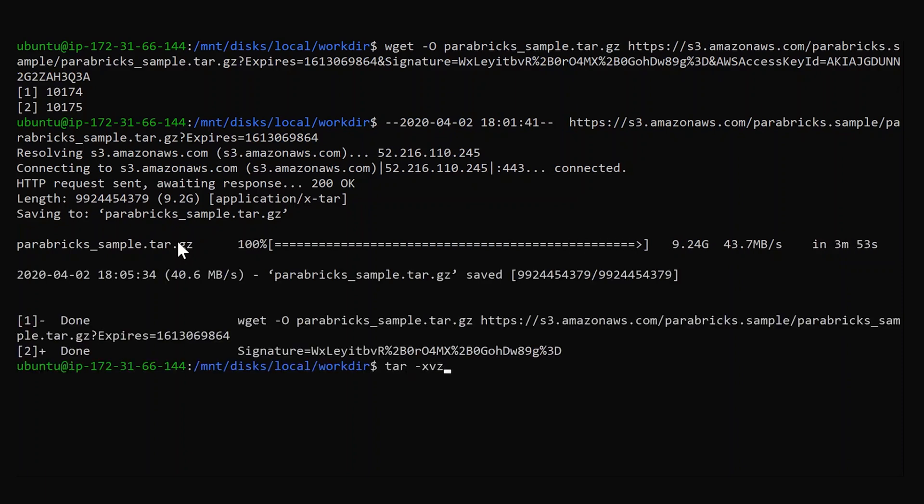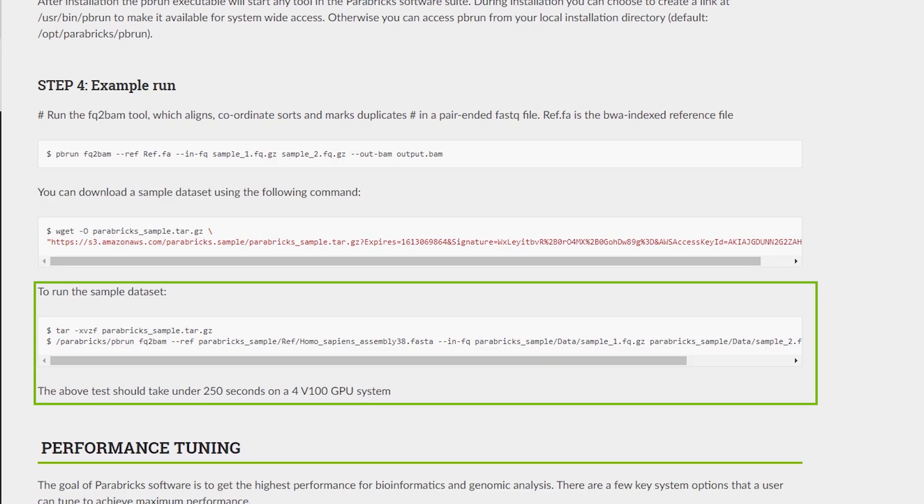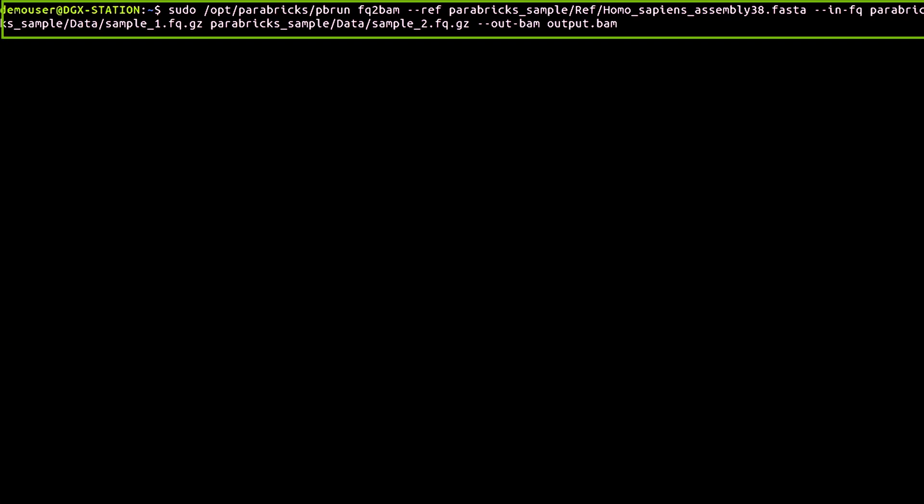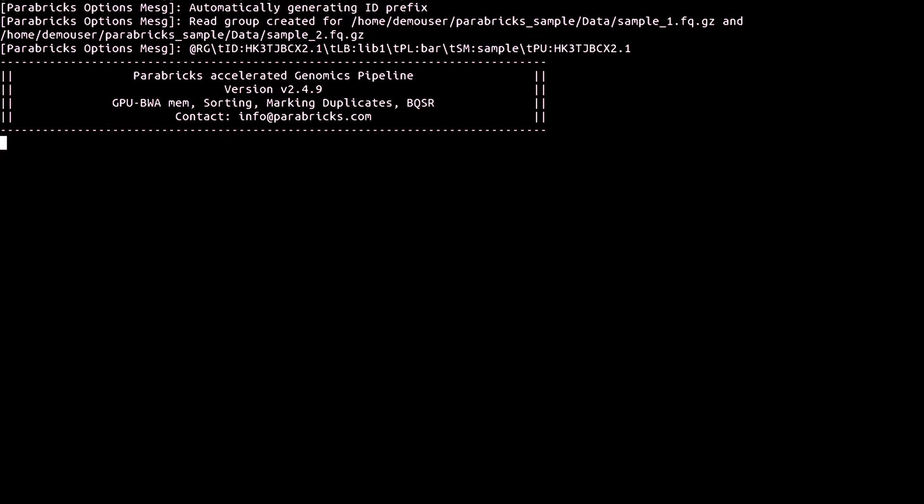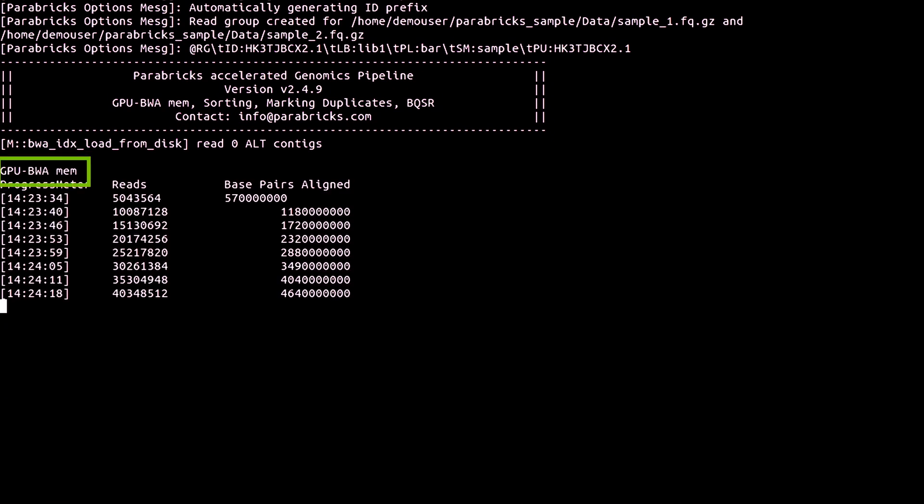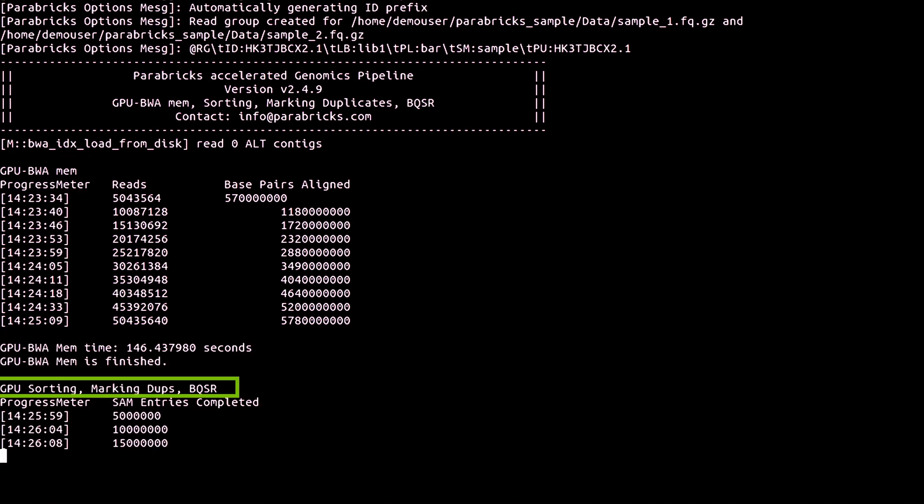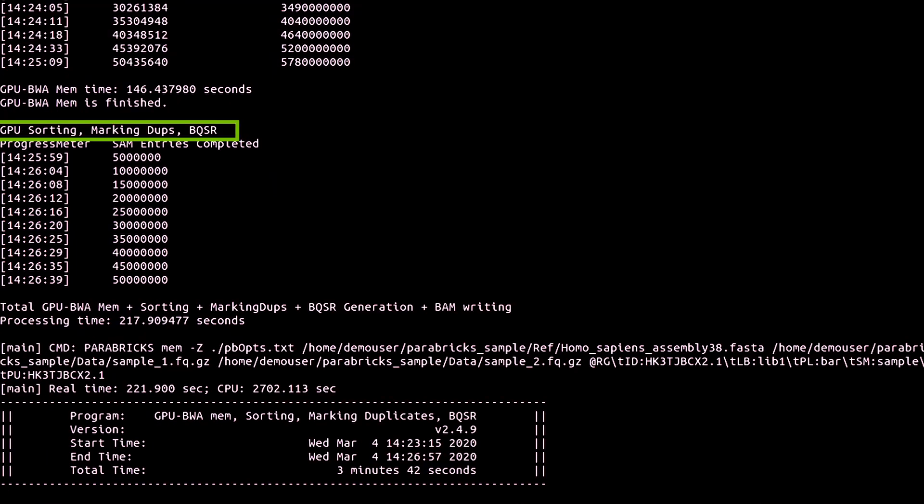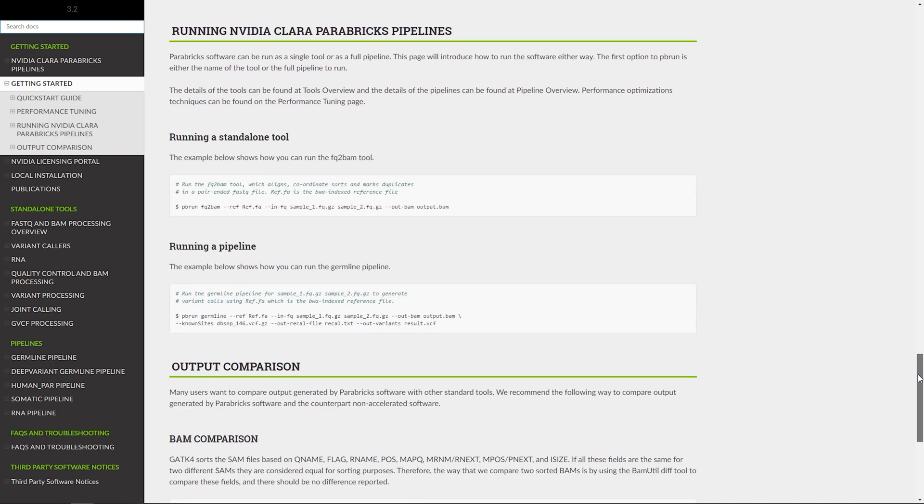This command will initiate the download. Uncompress the file. Now, we'll analyze the sample dataset using Parabricks. The command here runs FQ2BAM, an alignment and preprocessing tool that starts from FastQ files, runs BWAM, and coordinates sorting, marks duplicates, and performs the BQSR.